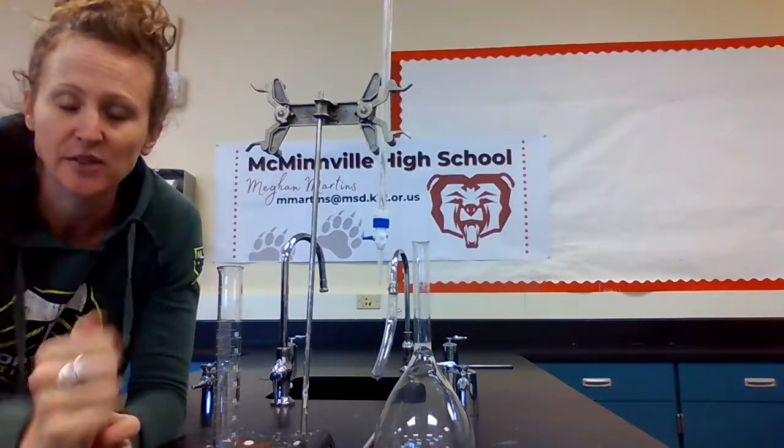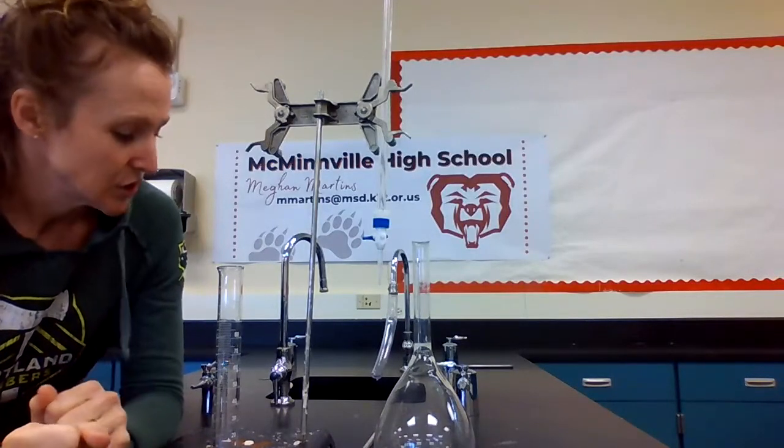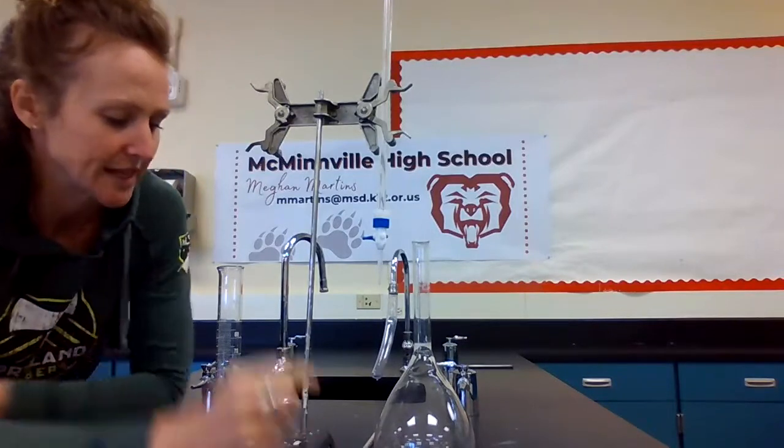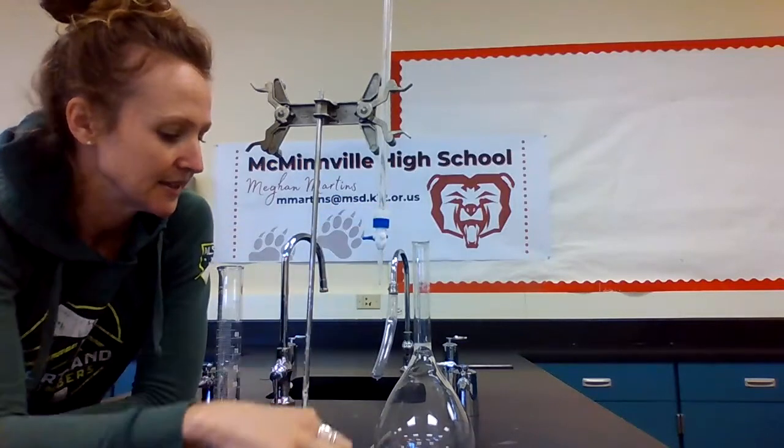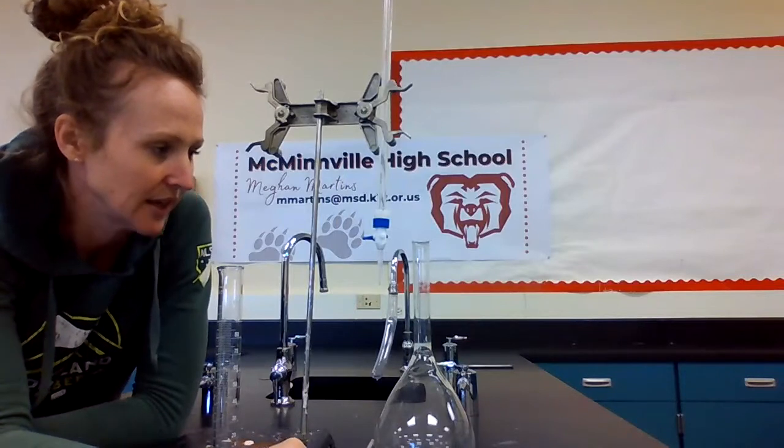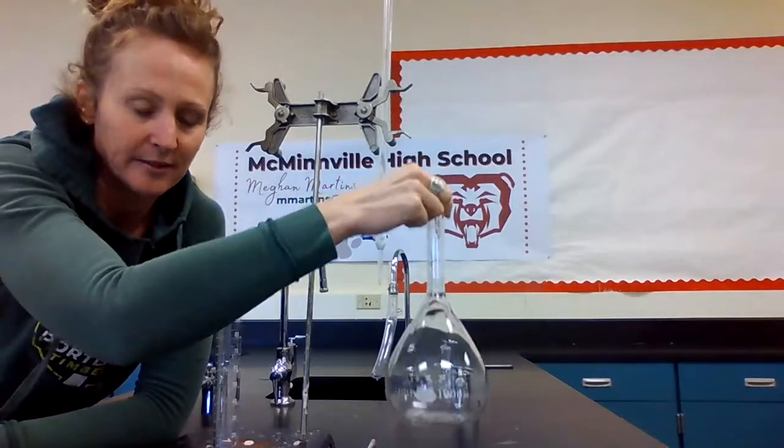That would be titration. So we're going to talk a little bit about titration, but before we do, I want to talk you through a couple pieces of glassware that are pretty similar, but you're going to use them for very specific reasons, and you want to know which one to choose in the right situation. So I have 4 pieces of glassware here. I have a graduated cylinder, I have a burette, I have a pipette, and then I have a volumetric flask.